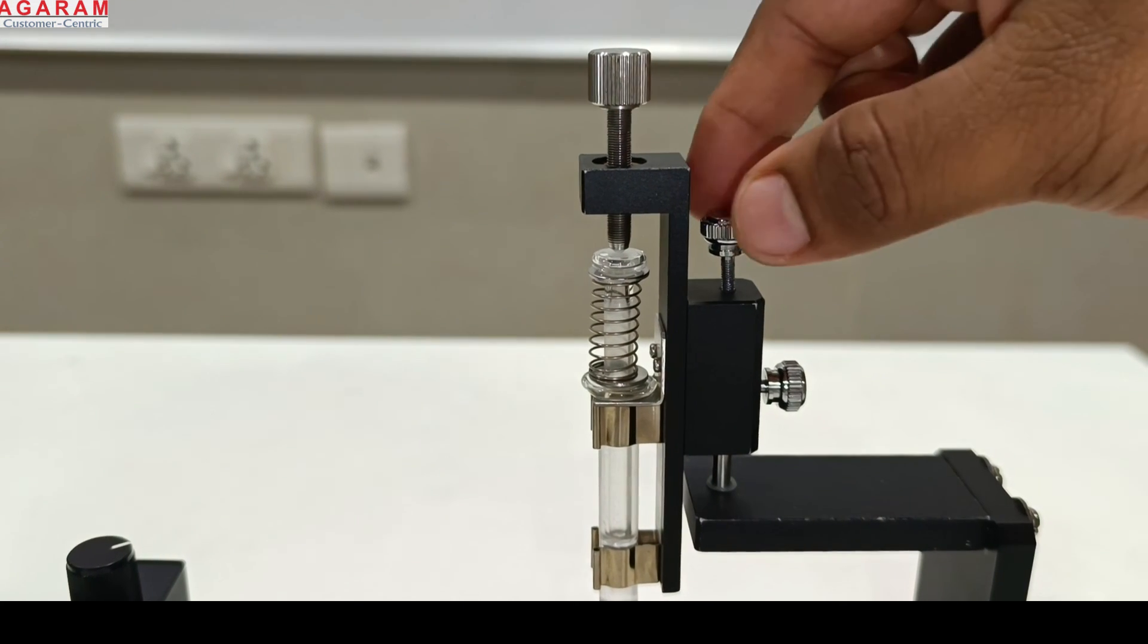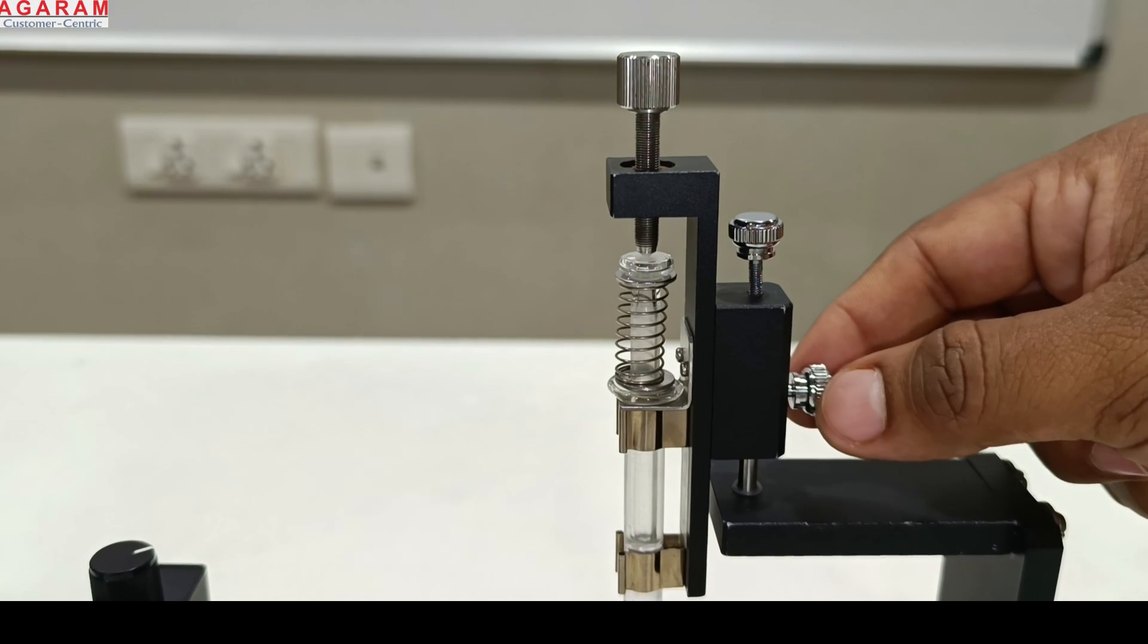Dispenser position can be adjusted to accommodate samples of varied sizes.